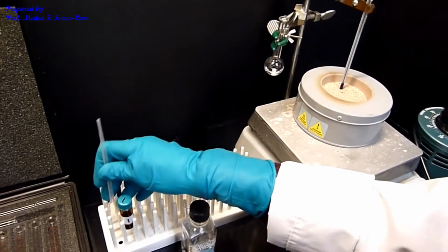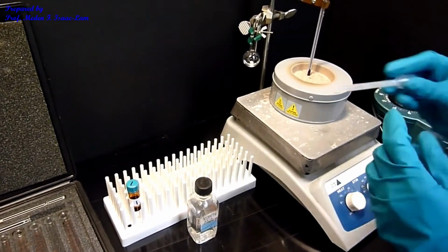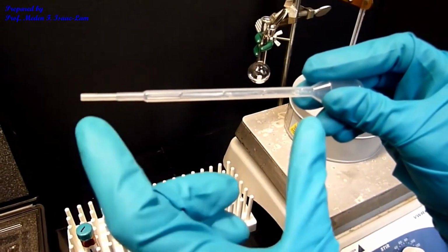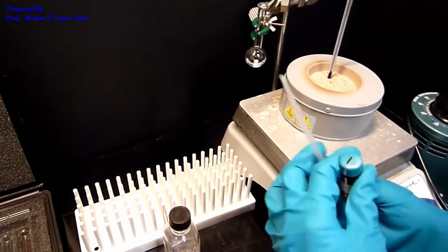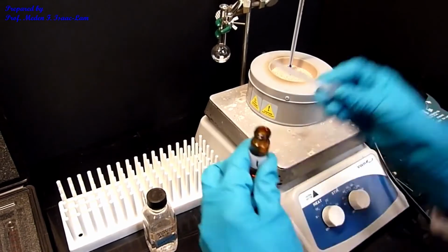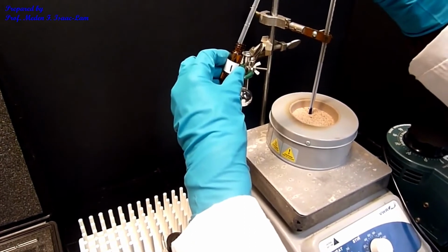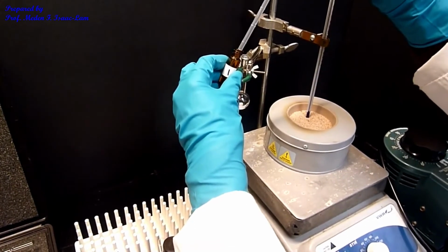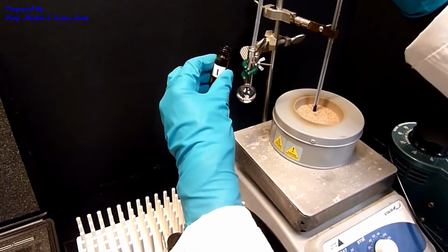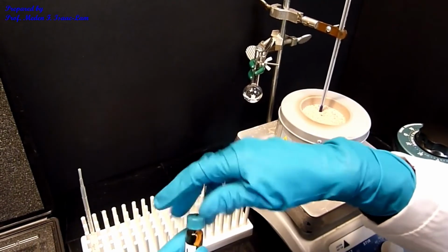So I'm just going to measure using a pipette. So this measures 1 mL. So I'm just going to measure 2 of these using this graduated pipette. So this is the alcohol. And I'm also going to add, so I just added 1 mL.